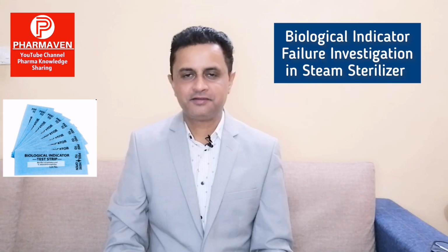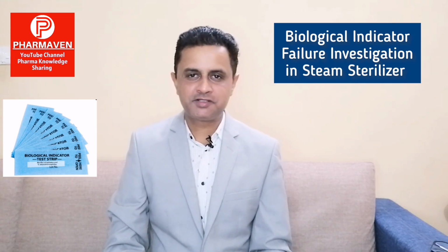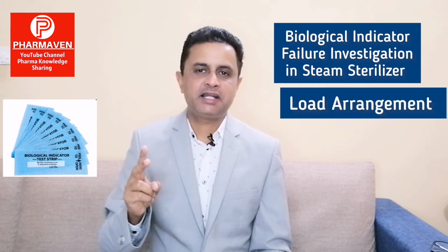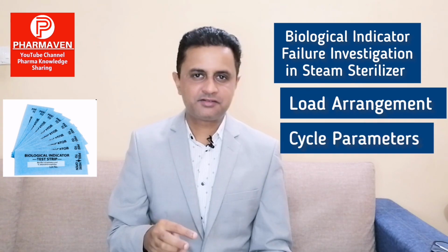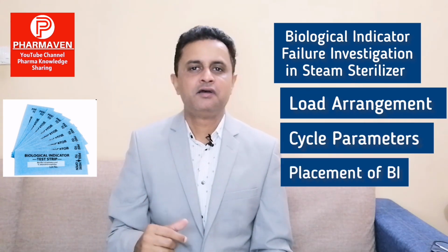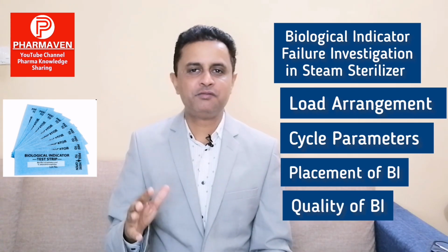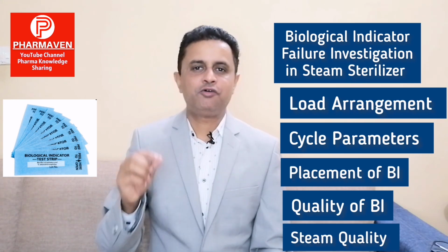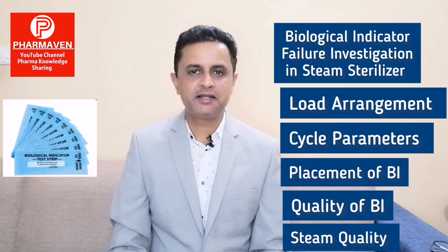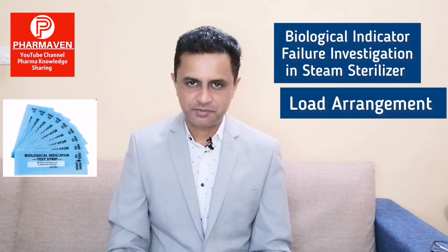Let us understand. I will be covering 5 important aspects of BI failure investigation. First will be load arrangement, second will be cycle parameters, third will be placement of biological indicator, fourth will be quality of biological indicator, and fifth will be steam quality. So, on these 5 topics I will be discussing today about biological indicator failure in autoclave. Let us first start with load arrangement.